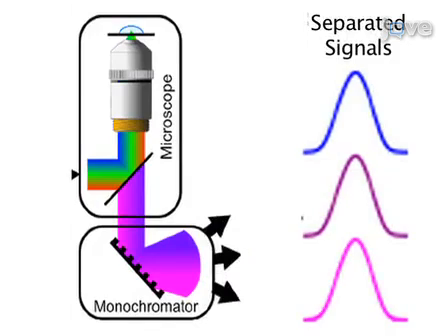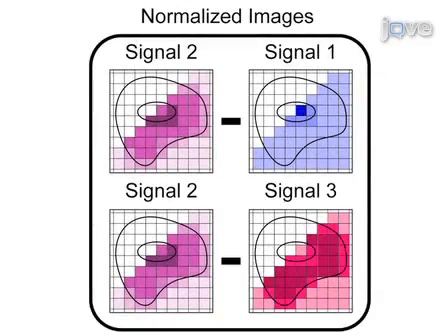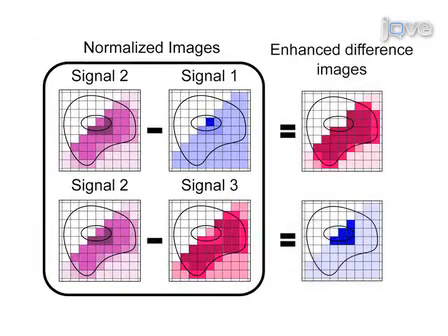from microscopic objects. Signals are converted into images using commercial software in order to compare different Raman signals that are produced. Results indicate that the difference between images obtained from doubly and singly resonant Raman signals provide enhanced sensitivity for weak Raman signals.